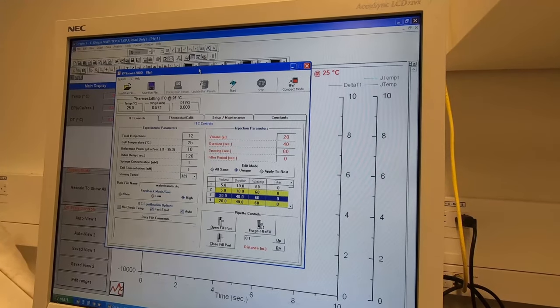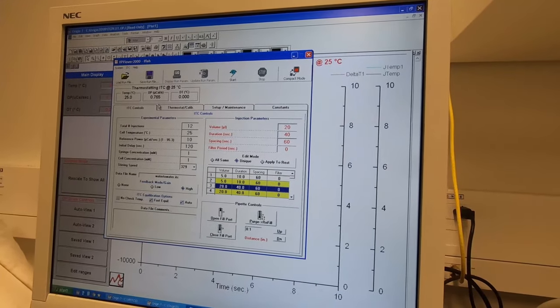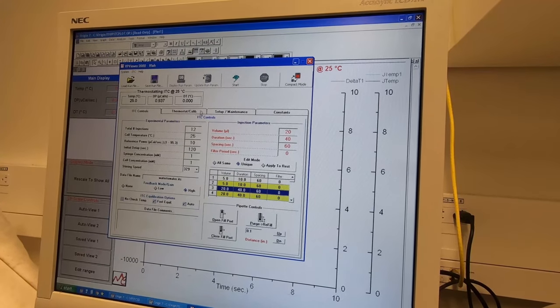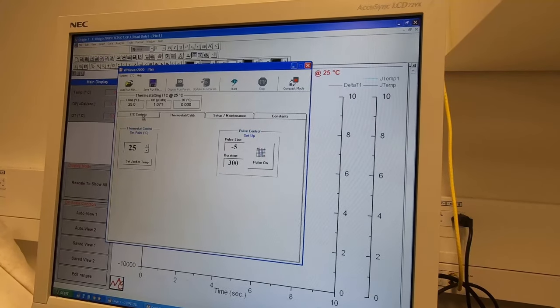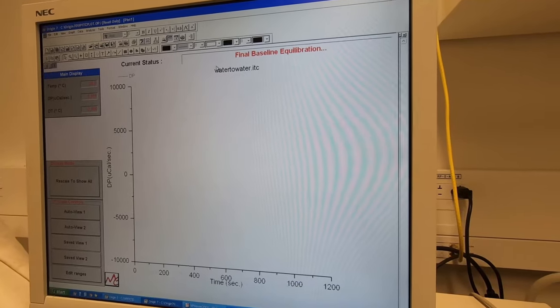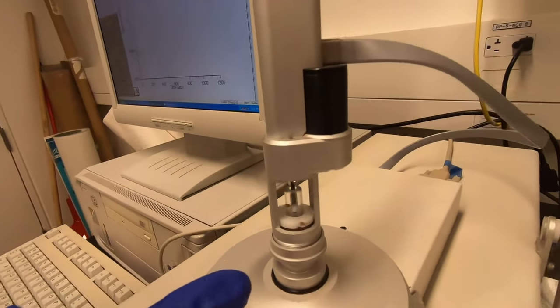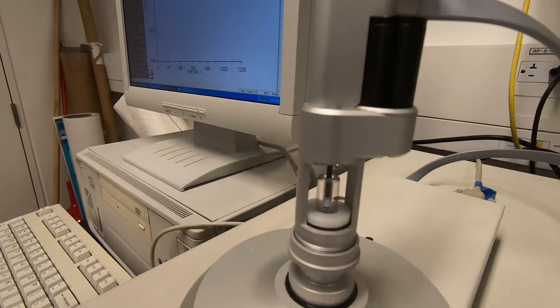Now the preparation for the experiment is done. You can see all the numbers here are black, which means it's already at equilibrium temperature — 25 degrees Celsius as defined. Now you can start to run the experiment. You will see a spinning indicator, which means stirring is happening inside. The injection will start in two minutes because we set the initial delay to 120 seconds.